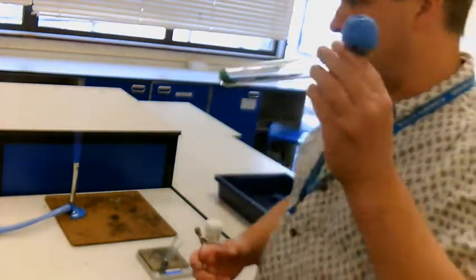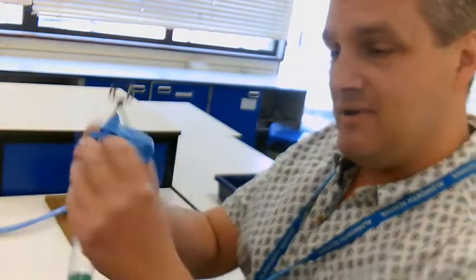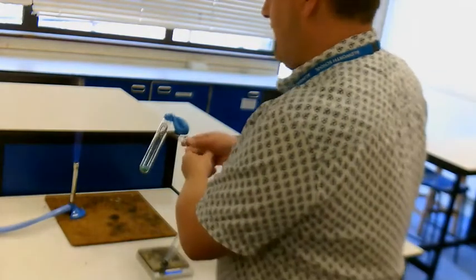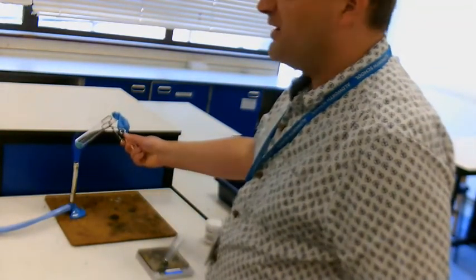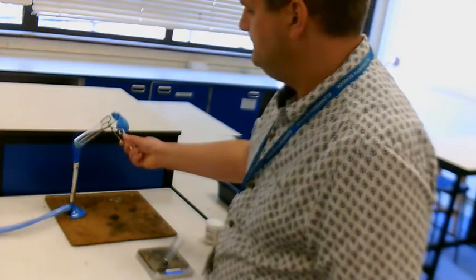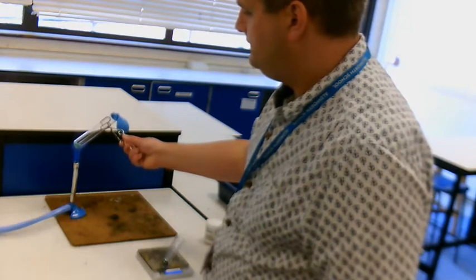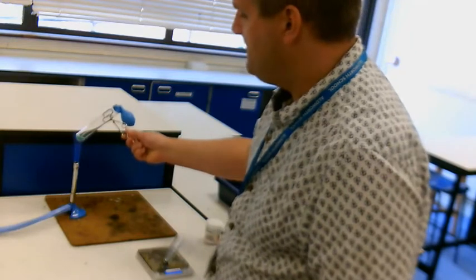So, same situation. Here is my powder. This time I've got my balloon that I am too lazy to inflate myself, sitting on top. So, much the same. Put it in the flame. Okay, it'll probably take 10 seconds or so. Probably should put it in the hottest bit of the flame, shouldn't I?